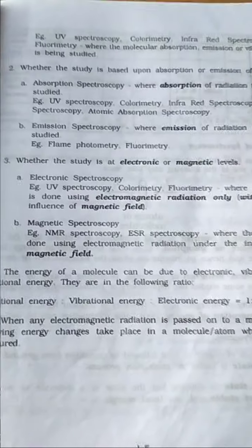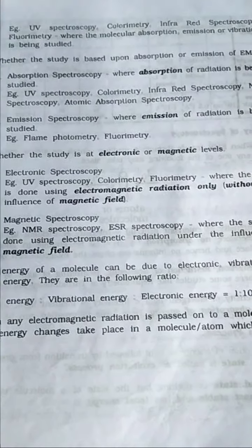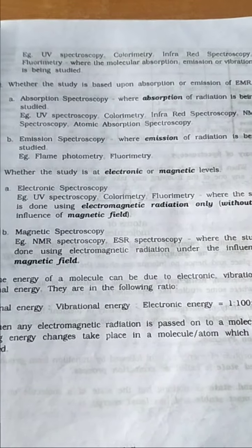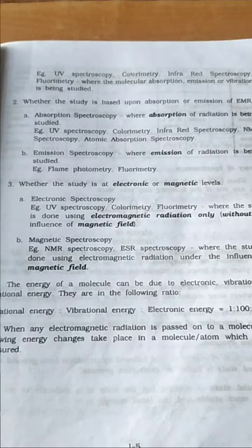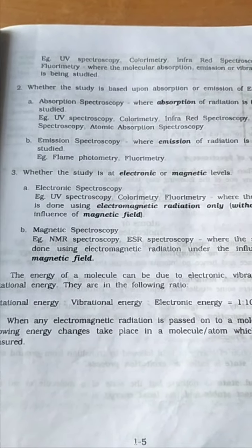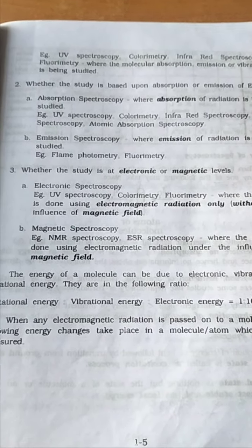We can easily understand the spectroscopy types from absorption. Changes in absorption is called absorption spectroscopy. Changes in emission is called emission spectroscopy. Changes in electromagnetic radiation is called electronic spectroscopy. Changes in magnetic field is known as magnetic spectroscopy.